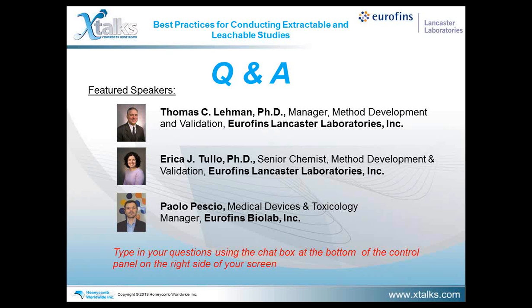Another question, is information from the extractable provided back to vendors to improve their designs of assemblies in terms of removal of certain plasticizers, for example? Your thoughts on that? Well, that's a great question, and I'm not sure I have an answer for that because that's going to be dependent on the end users. From our scenario, we're providing a package to the end users that details the extractable study data. What happens with that is unknown, but it is not a bad idea if the end users are willing to share that information. Of course, then you have to get into confidentiality agreements and so forth to share that data, and you're bringing legal into the picture, so I don't know how easy that process would be.